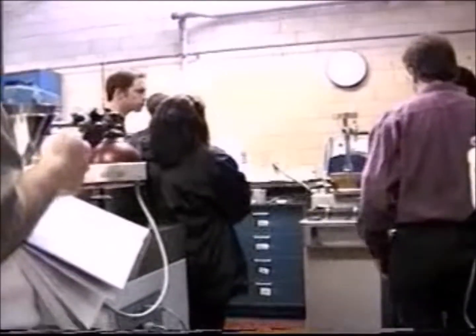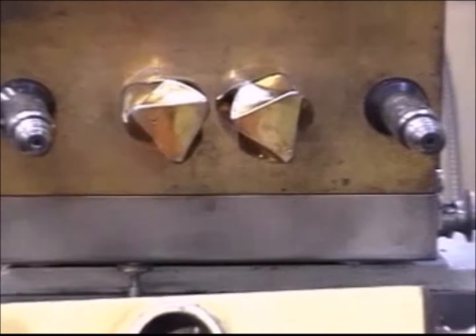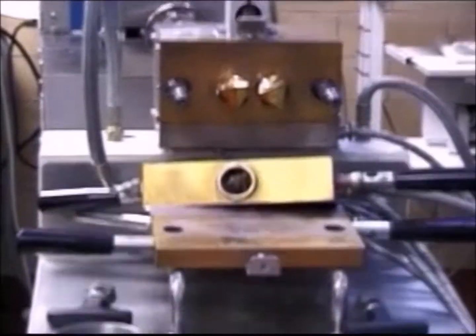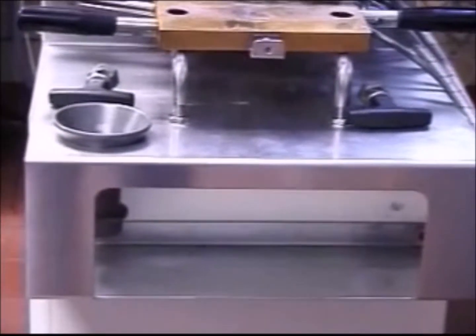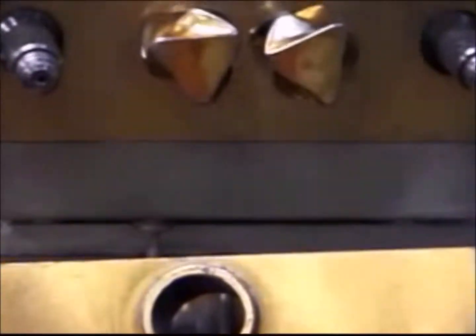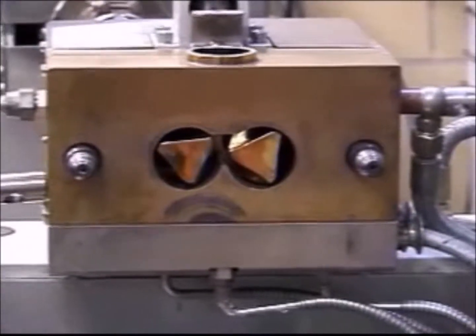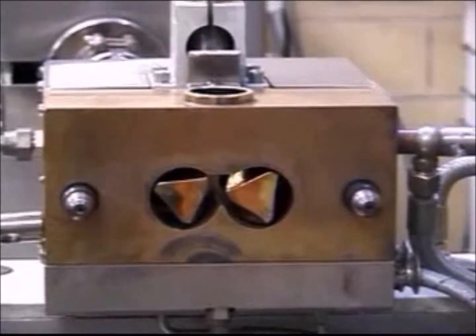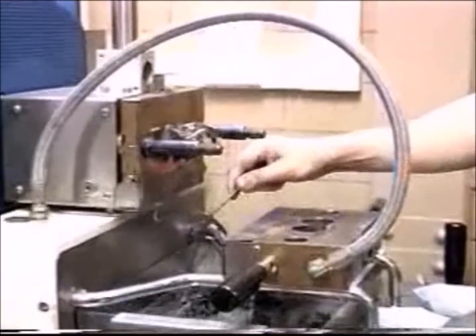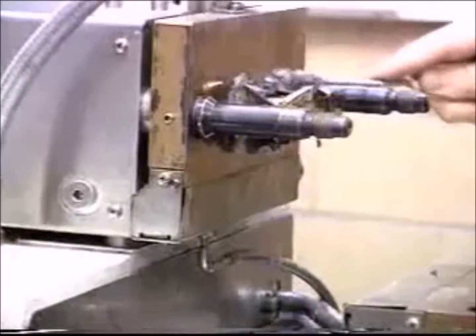The torque rheometer is used to determine the maximum solid fraction and mixture stability. It is composed of two counter-rotating mixing elements attached to a drive motor. The extruder sensors of the Rheomix range enable the determination of rheological variables as well as the examination of processing characteristics and the production of feedstock for further analysis. The equipment is computer interfaced to control all rheological functions.